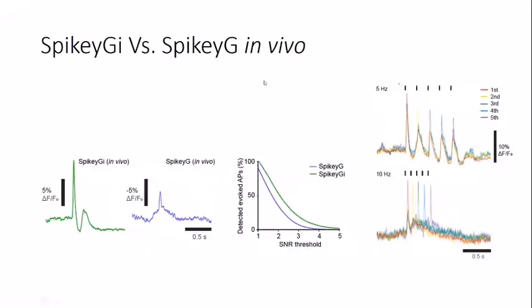But that's just kind of an assumption of why we're seeing this. And another thing: on the right side, you can see the average trace that we extracted from each, so we have five hertz air puffs and 10 hertz air puffs. We only average those traces that have a detected event at the certain air puff. So we can see how this fast microscope and the fast voltage indicators can really keep good temporal resolution for those fast neural activities, compared with calcium indicators.